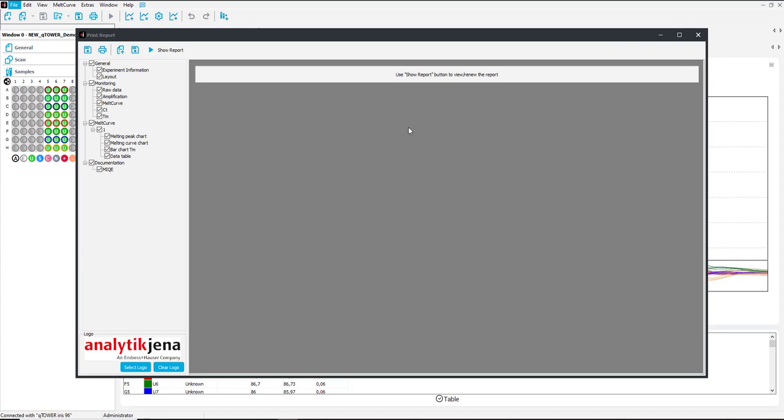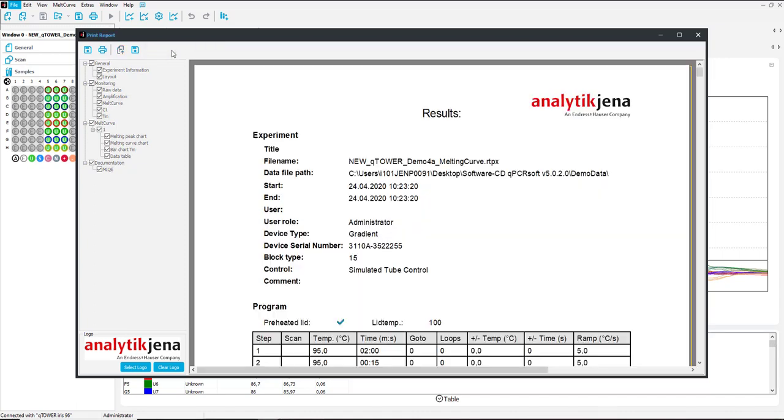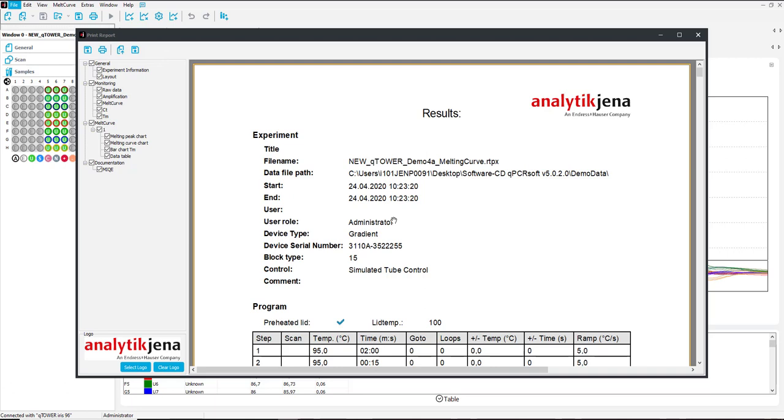On the left side you choose the different information you want to have shown and then press show report. Then you will have all the different setup information and tables which can then be directly printed or saved.